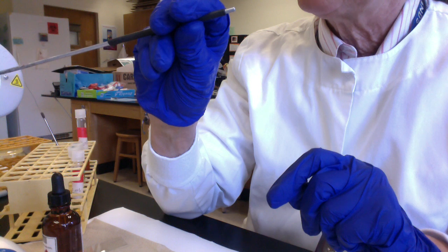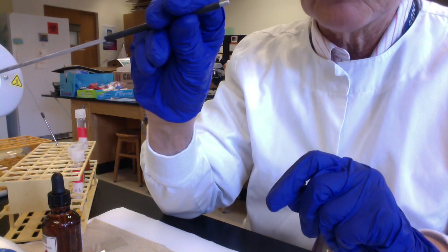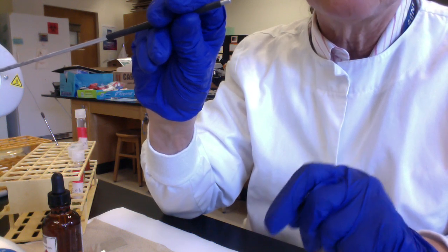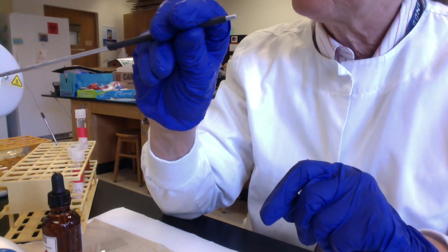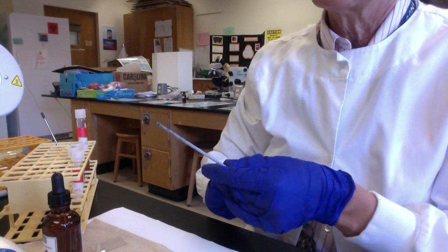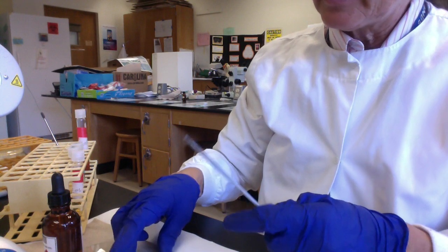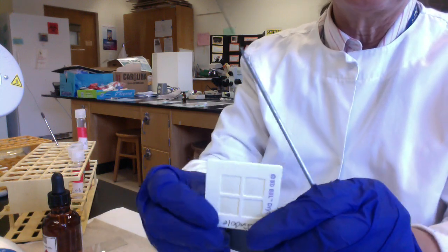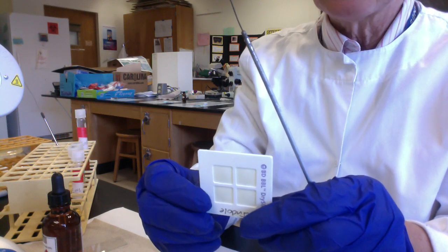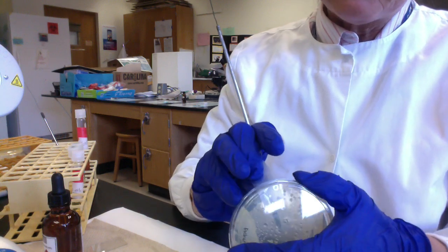So the question we're trying to answer in running the indole test is, does our microbe make the enzyme tryptophanase to break down the amino acid tryptophan into indole and other end products? So what we're going to detect is actually the end product of that breakdown. We're going to be detecting indole. And this is really neat, you guys. Nowadays, all of our reagents are in these dry slides called indole dry slides. And so real simple benchtop tests, all we have to do is harvest our cells from our pure culture.